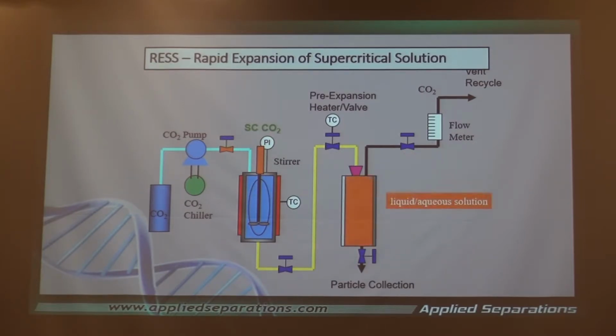You can also, instead of doing it at ambient air conditions, spray this into a liquid as well. An aqueous solution is often what is used. Some of the problems that you have, if you put it in this system here, is that these particles often agglomerate. So you may think you're going to be making the material at, let's say, 100 nanometers, and actually it agglomerates together and you have something that is 20 microns as opposed to 200 nanometers. They agglomerate very easily. This is one of the reasons why you disperse them in a liquid, because they will not agglomerate as quickly.